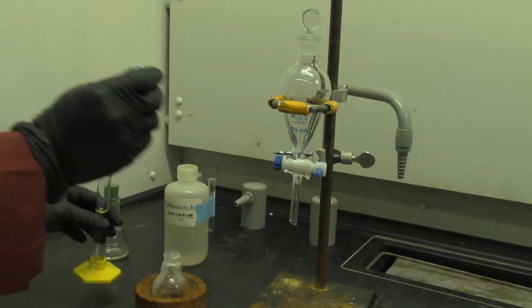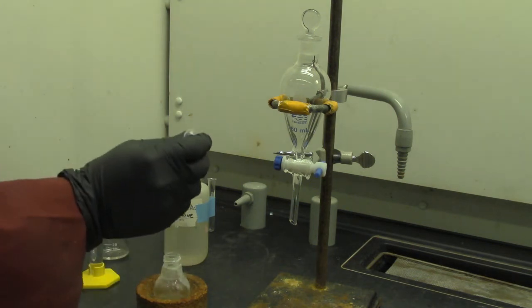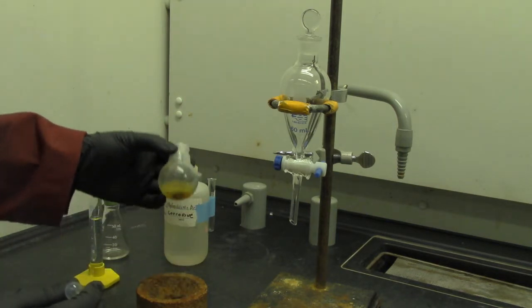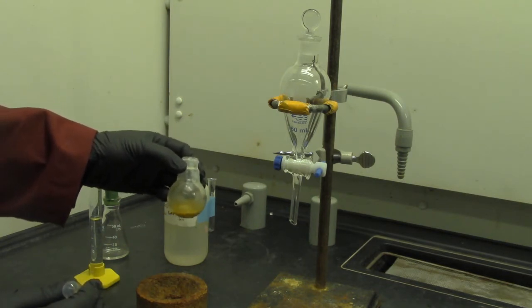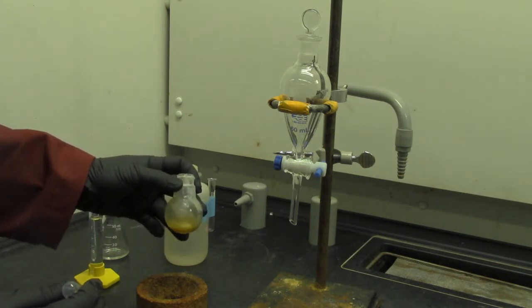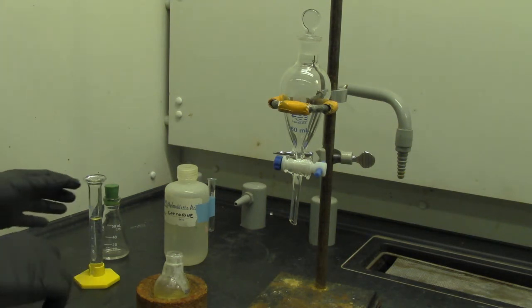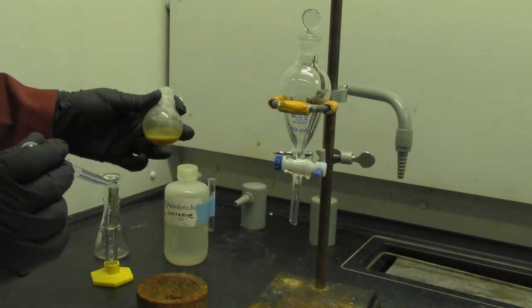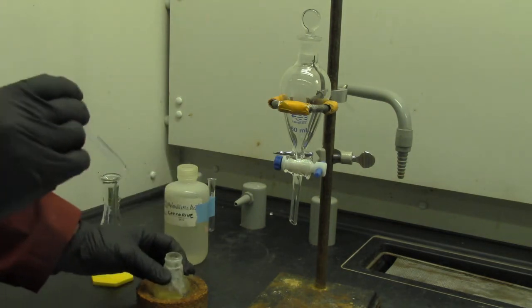So add it a little at a time. Swirl it. You see it's bubbling. So with acid added, some unreacted magnesium will form a gas, right? So they produce gases. Acid will dissolve the magnesium.